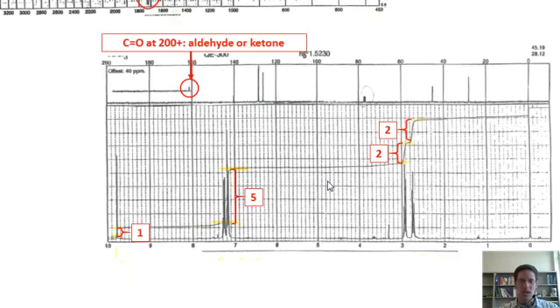The next thing that I do with my hydrogen NMR is determine based on where these appear what they are. I've got a peak that's right close to 10 and it integrates for 1. What is that? It's of course an aldehyde. That's consistent with what I discovered in my carbon NMR. My carbonyl compound has to be either an aldehyde or a ketone. Now what about these signals? They appear between 6 and 8 ppm. What land is that? It's aromatic land.